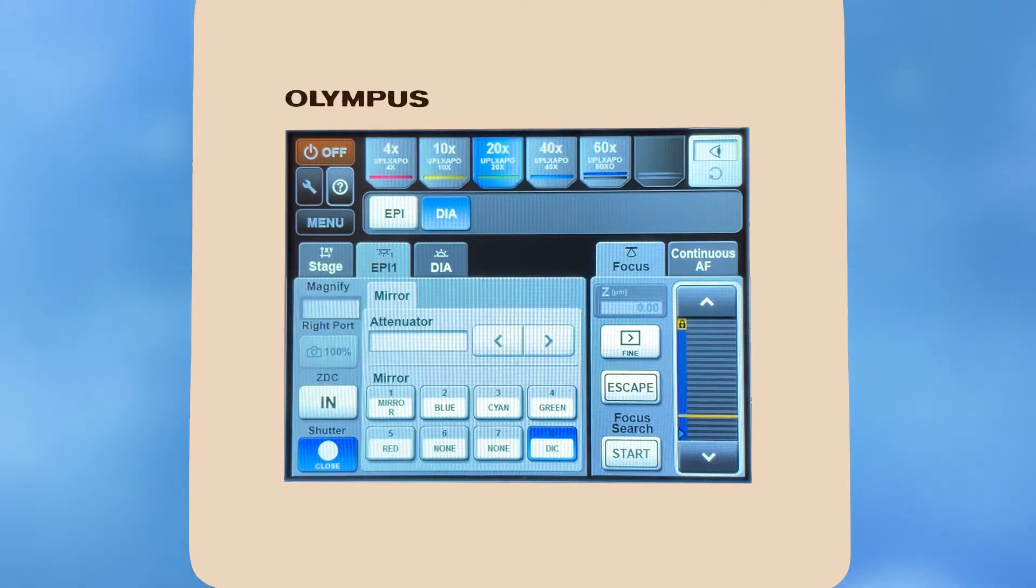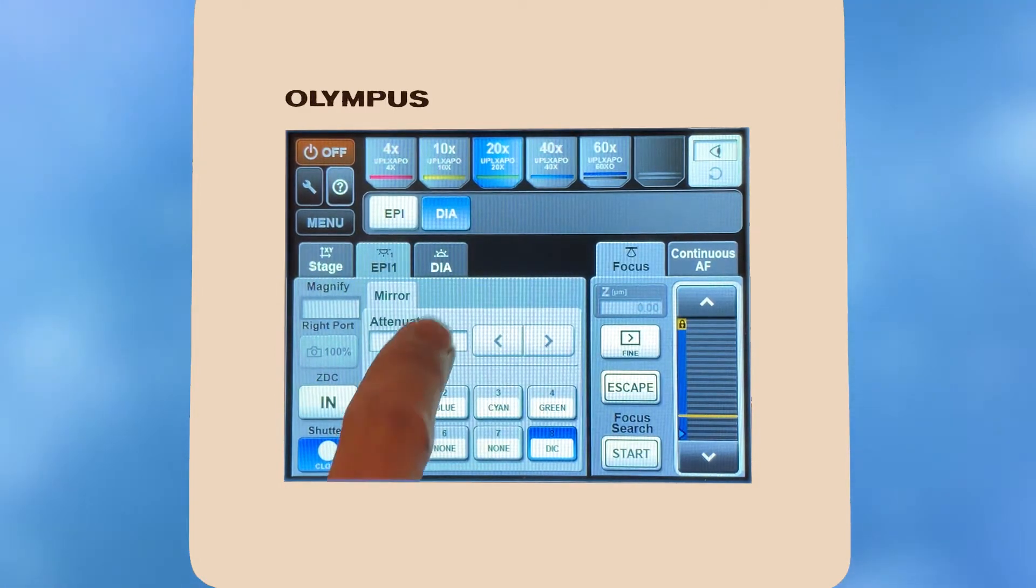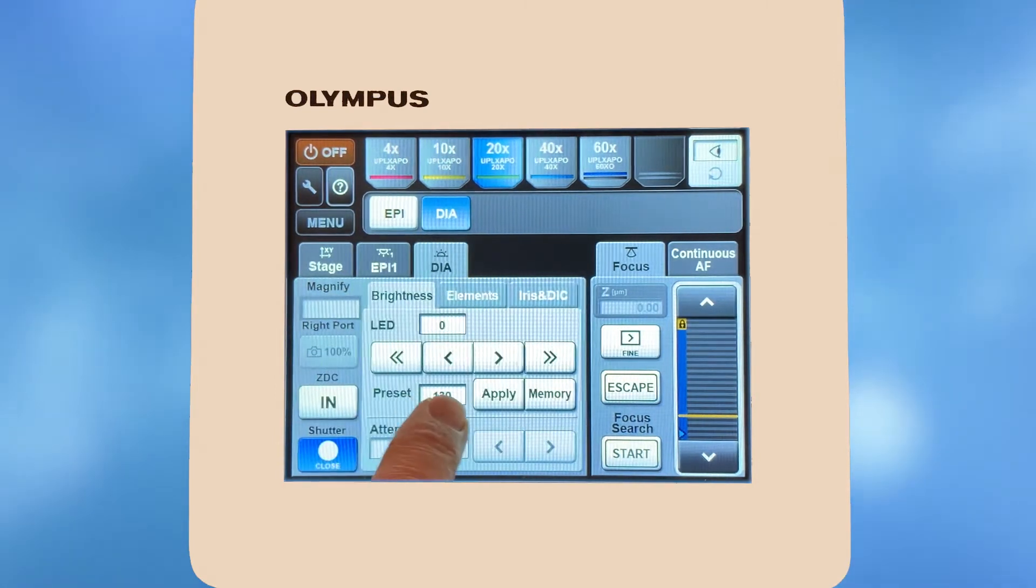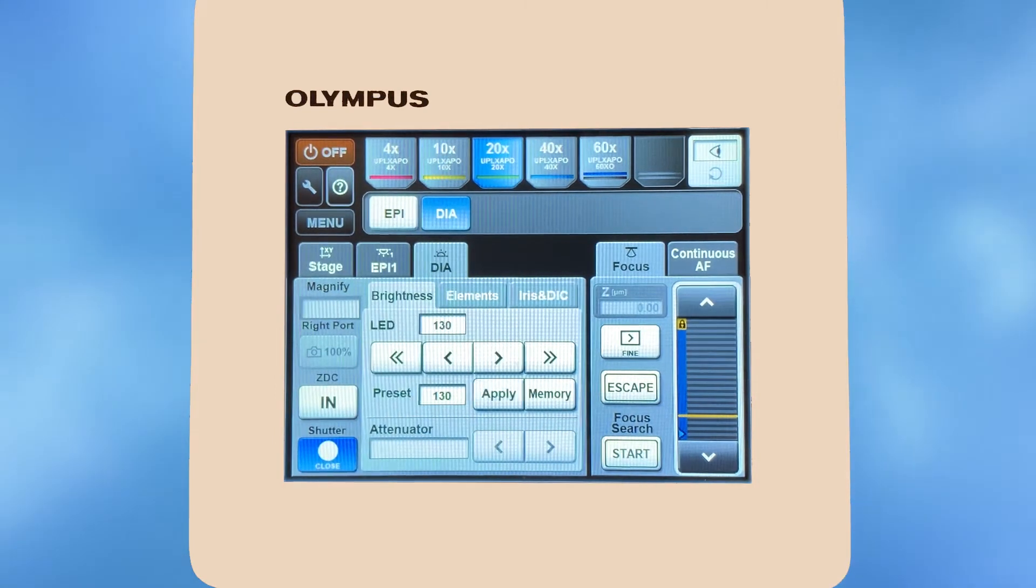To turn on the transmitted light source, select the DIA tab, adjust the LED brightness if desired, and press apply.